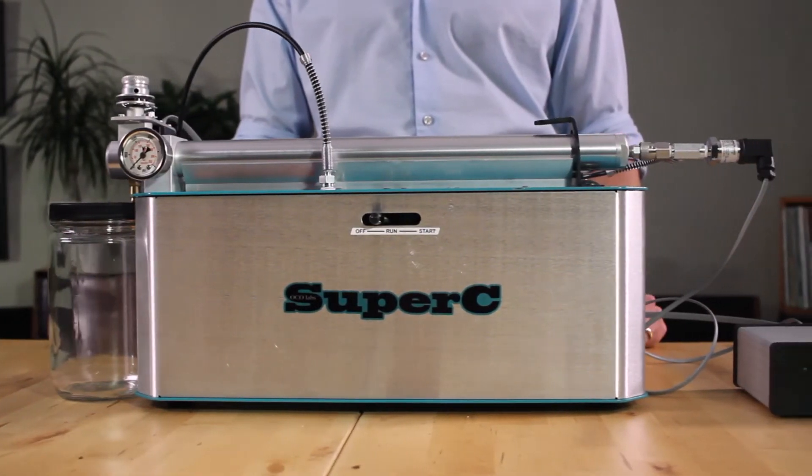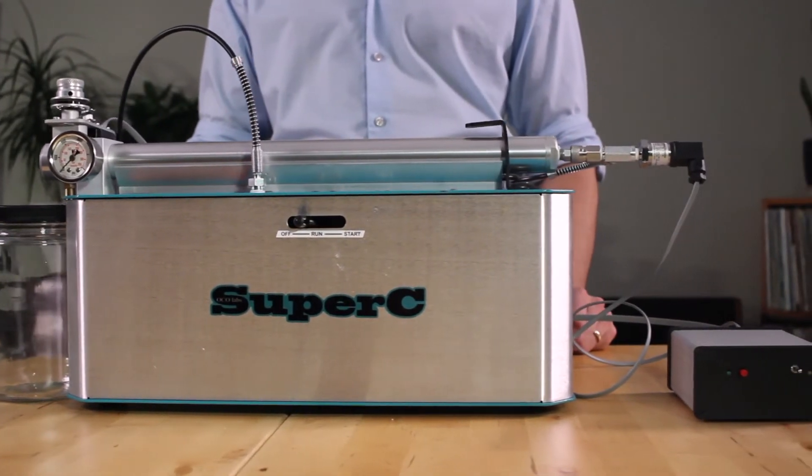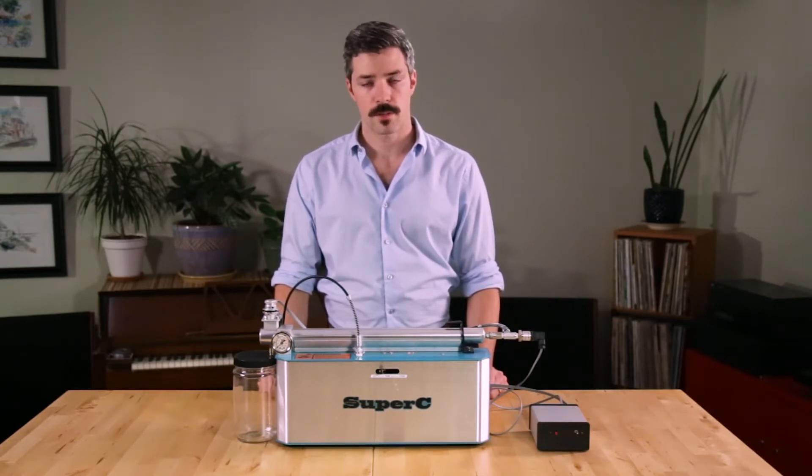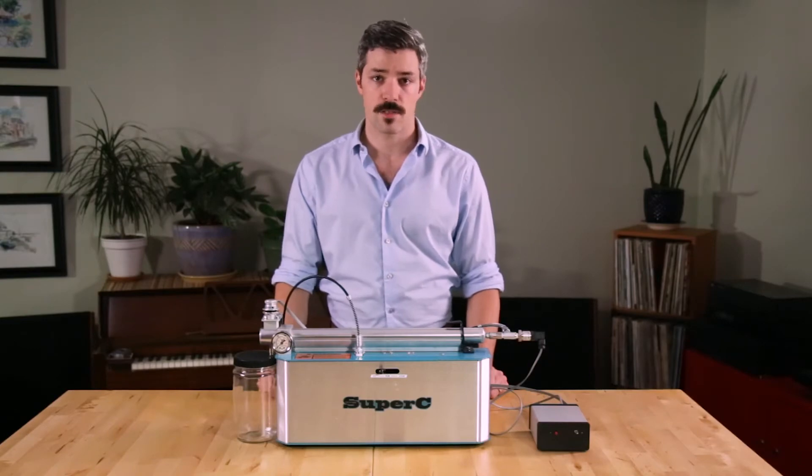The Super C is a tabletop supercritical CO2 extractor scaled appropriately for research, batch screening, and home extraction. Requiring far less in the way of electricity, the Super C can be run off of a single 110 outlet and can be fed by any standard gas-feed CO2 tank.